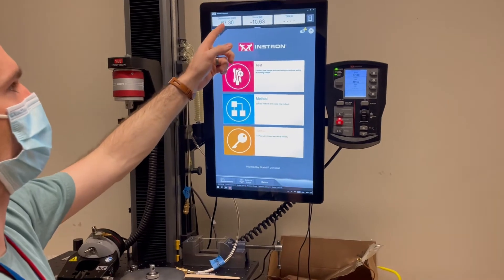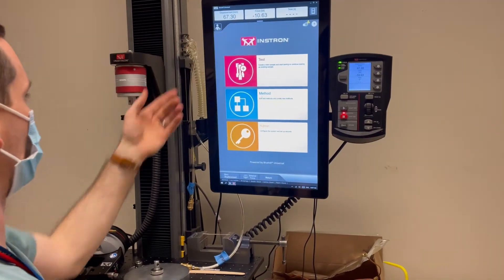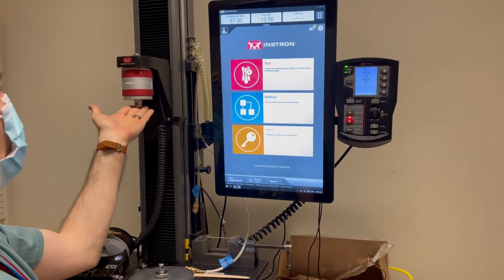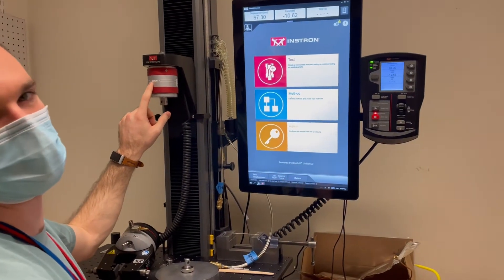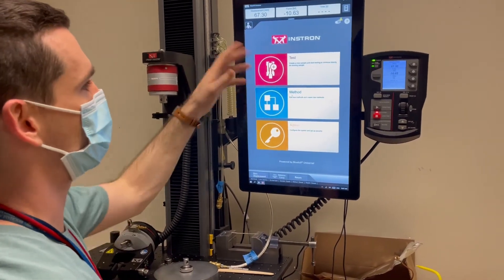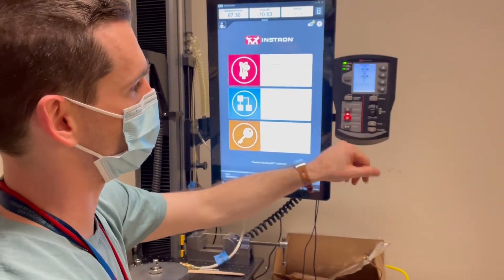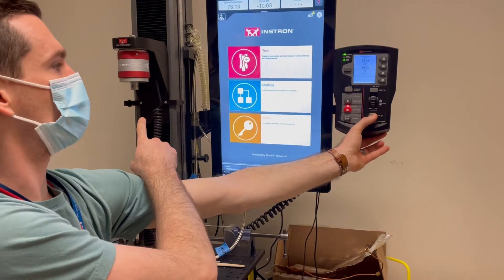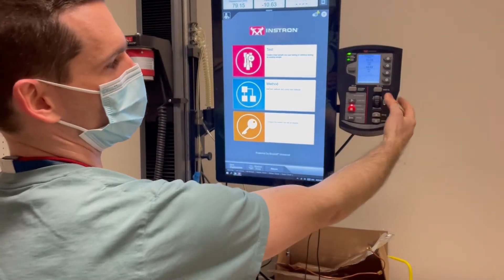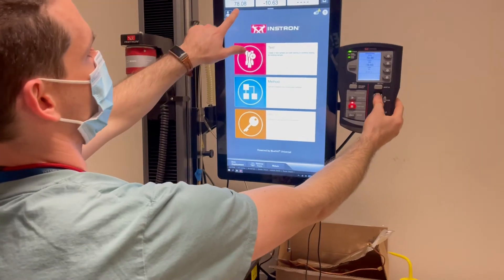You have a live display of displacement, controlled by the up and down position, the force on this load cell right here — on the front of the load cell you can see the capacity, this is a 500 newton load cell — and the time. There's also a touch screen and controls to move the head of the instrument up and down. To tweak fine position, you can roll this dial; it goes by very small fractions of a millimeter.